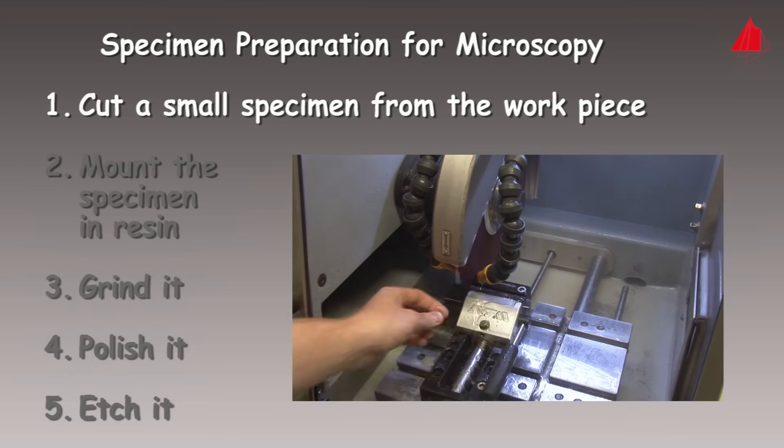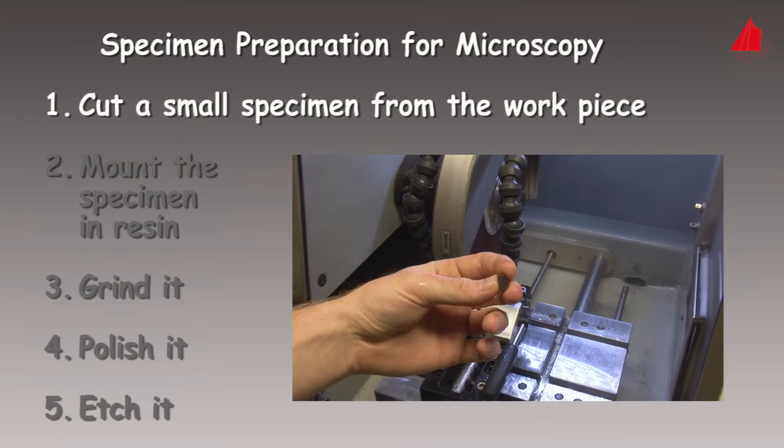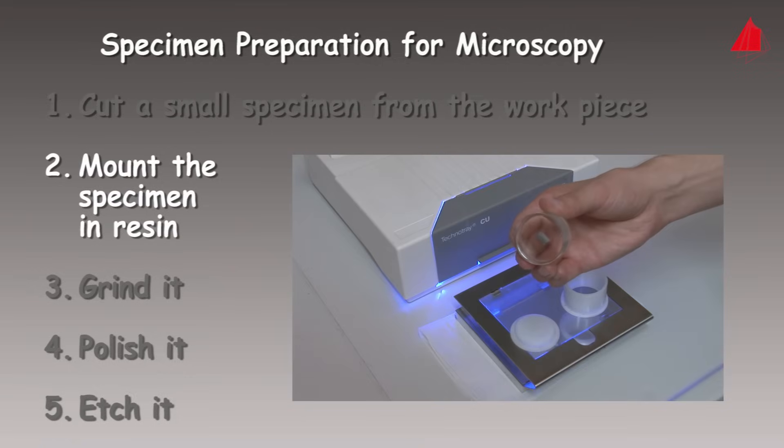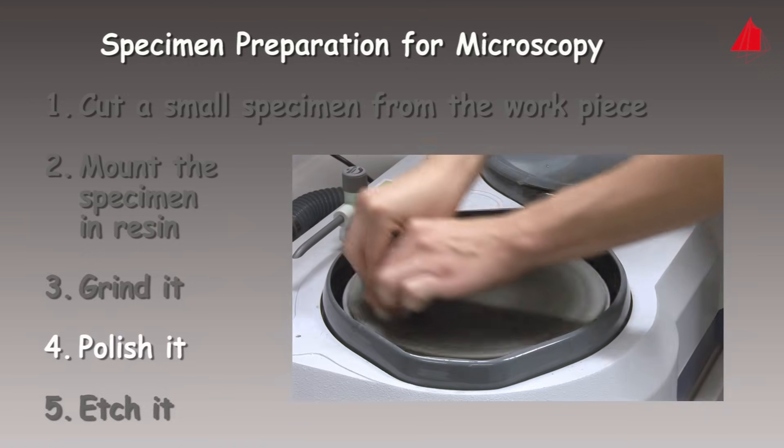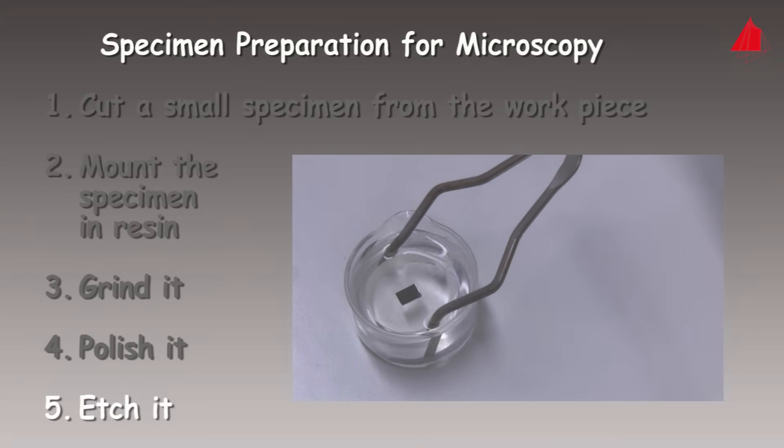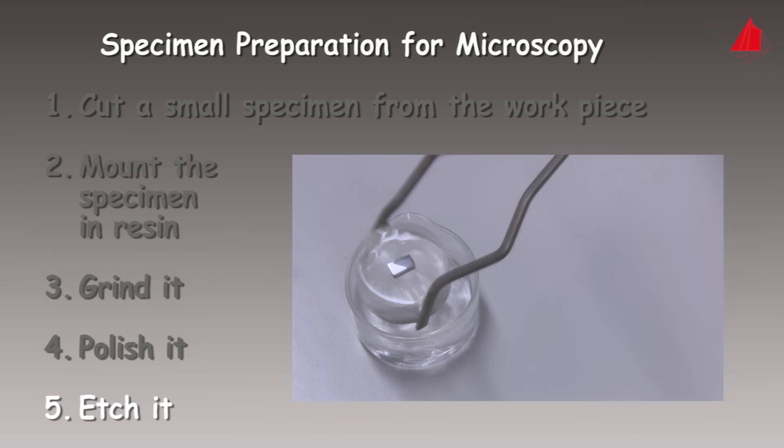First of all, a small specimen has to be cut from the actual workpiece. The specimen is mounted in resin, ground in several stages, polished in several stages and finally etched. Now the specimen is completely prepared and ready for microscopy.